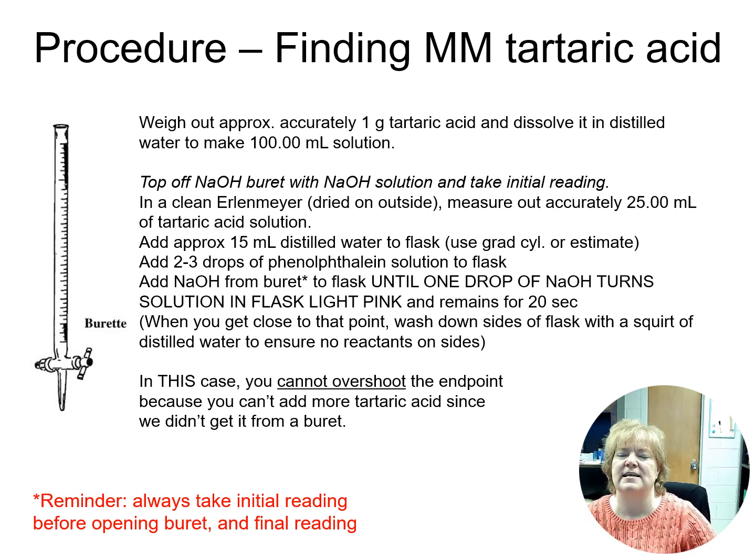Okay, anyways, you get the endpoint. Again, light pink. There is no back titration here because, again, we added from a solution that we made, so you can't just add another drop and have it be quantitative. You're just going to have to start another trial. So that's a little bit trickier, but by this time you've just done a bunch of titrations, so hopefully you can figure that one out. Again, always take your initial and final burette reading.